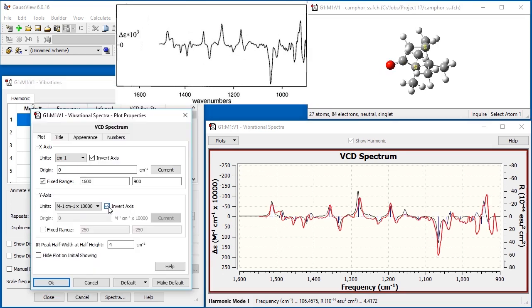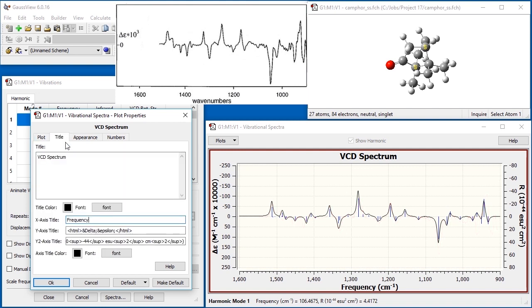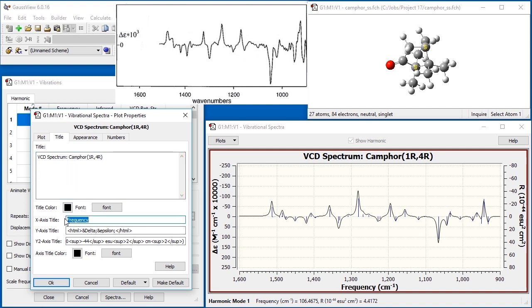We want to prepare a publication quality image for this spectrum. To do so, we need to change a few of its display properties. First, we specify a more descriptive title for the figure. We also change the label for the x-axis. GaussView automatically adds the units to both axis labels.